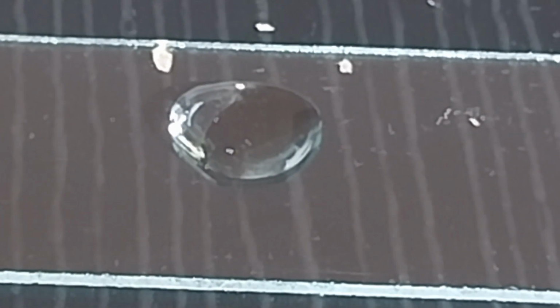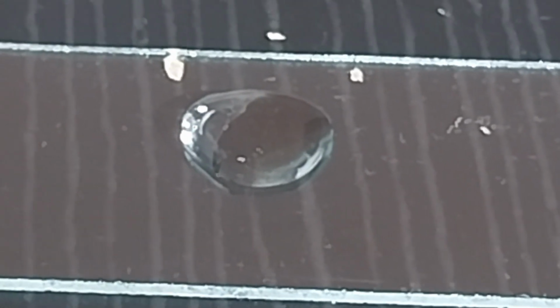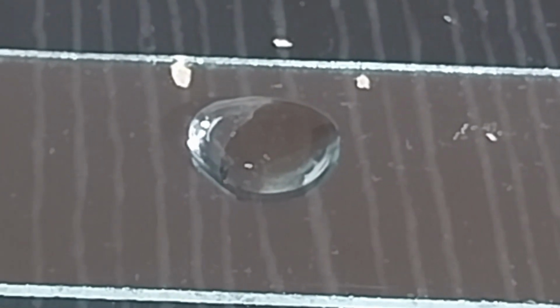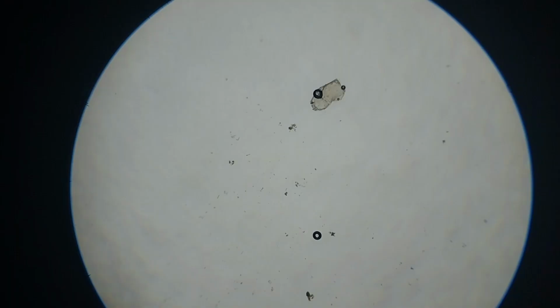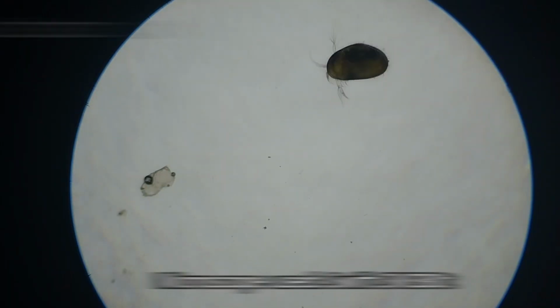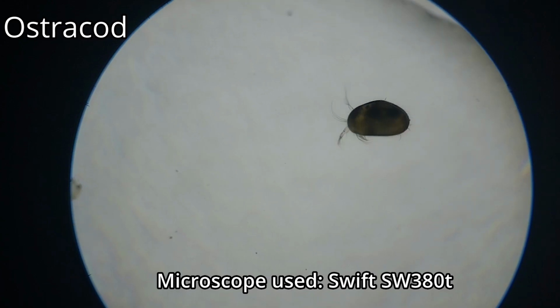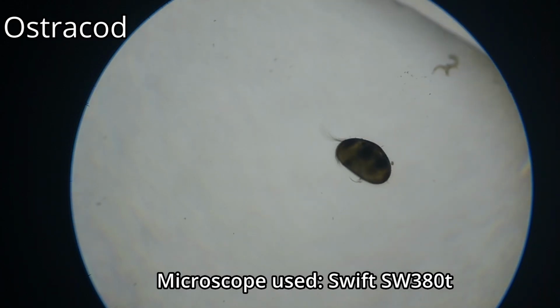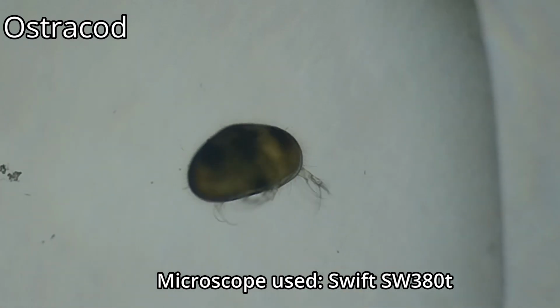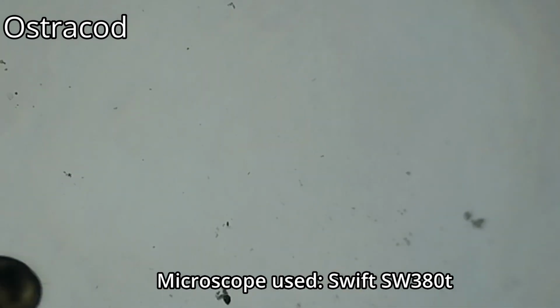It can be challenging to see when filmed through a phone camera, but this tiny dot is actually an ostracod. Let's take a look at it under the microscope. Under the microscope, it is hard to follow the ostracod, which is because it is very fast and active. Ostracods are sometimes called seed shrimp. They earned this name due to the shape of their shell.